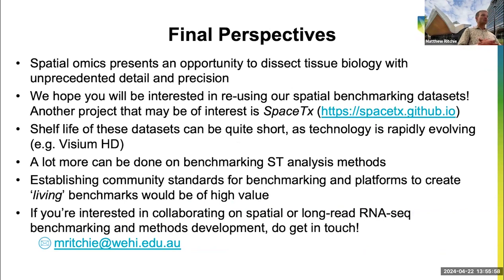So the final perspectives here is, well, hopefully the data could be useful to people in the room. If you have an interest in benchmarking, then maybe some of these data sets that I mentioned, cadasSTre and SpatialBench, might be something to use or reuse. Another project you might be interested in knowing about is SpaceTX, which also has reference tissues that they've tried to generate data from across multiple different technologies.